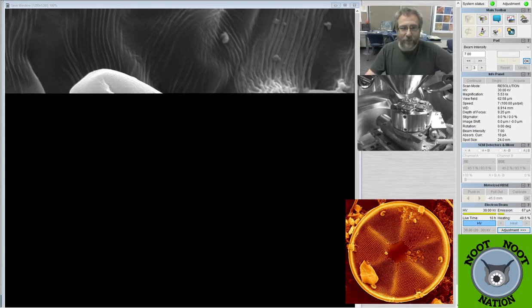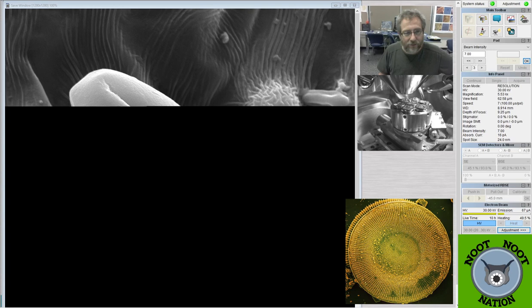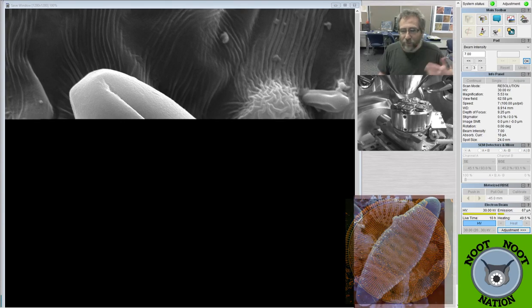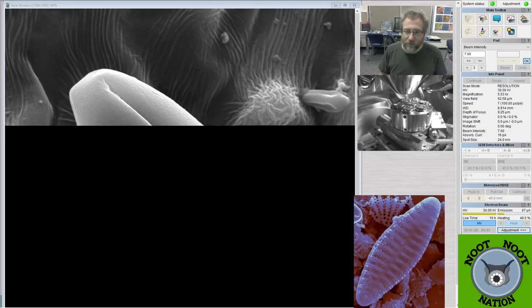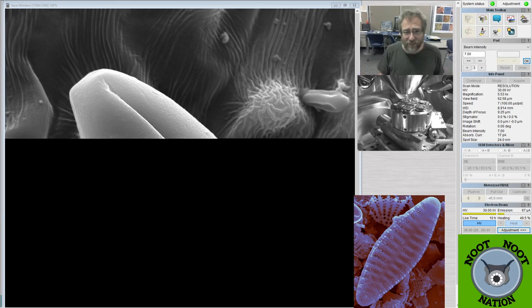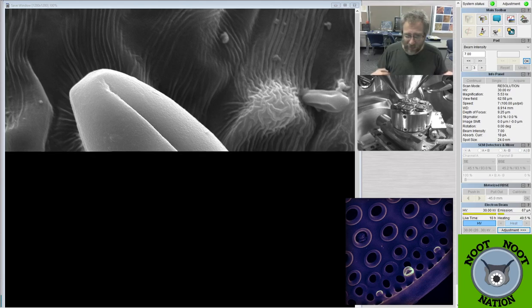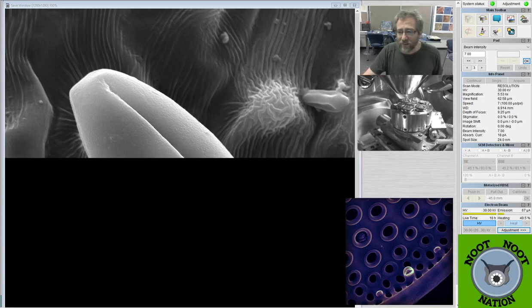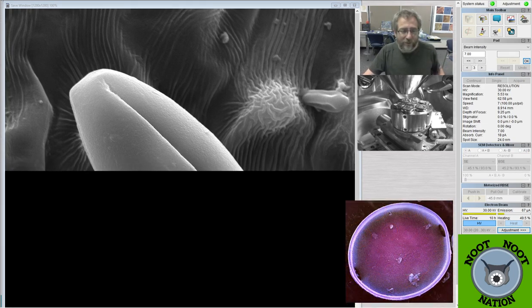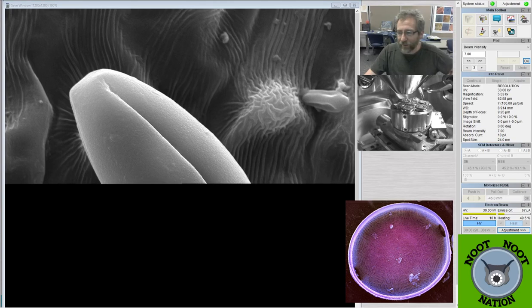I should harass an entomologist to collect some pollen from the legs of bees and bumblebees. I've done that. I don't need to harass anybody. We've actually found dead bees and dead wasps and all kinds of insects, and we're starting to get into insect season. We've looked at those on the SEM before in previous streams, and you can see pollen stuck on them. I have dragonfly wings with pollen stuck on them too. Pretty much any insect or bug probably has some pollen stuck on it. It's just everywhere. It would be nice if it were rich with pollen, because then you'd have a whole collection of different things. But I don't need to harass an entomologist for that. I can just collect a dead bug.